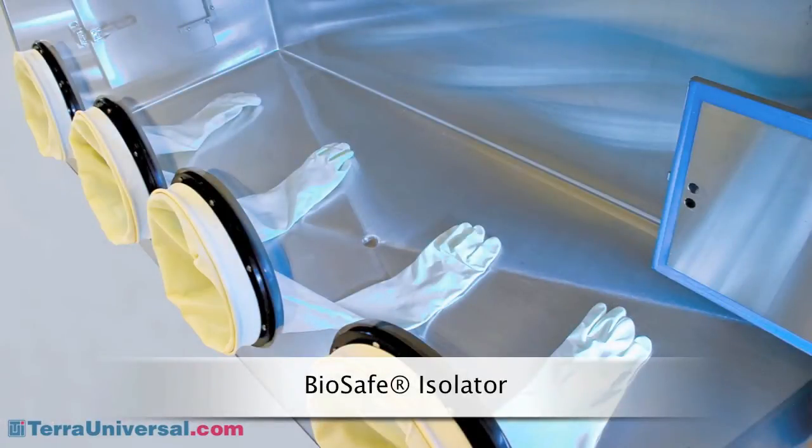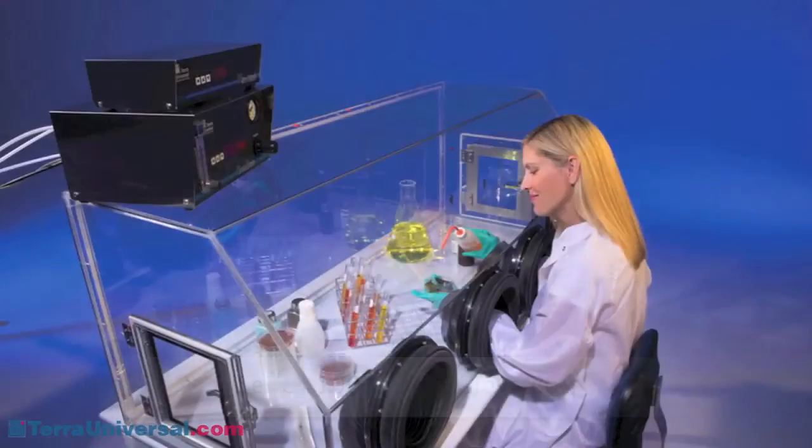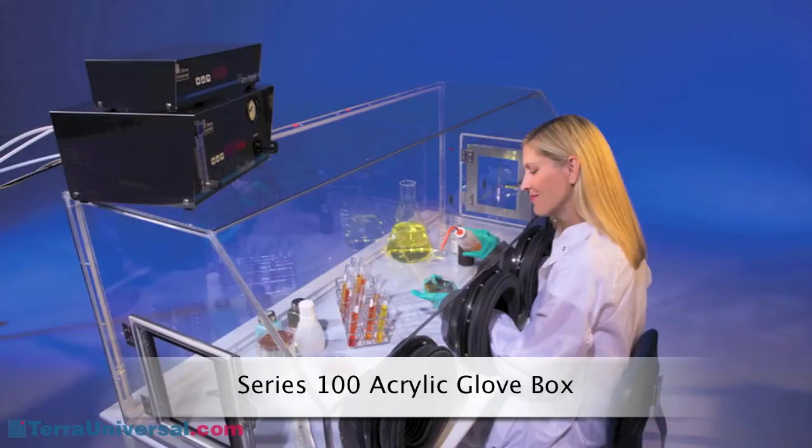BioSafe isolators are easy to wipe down and stand up to strong disinfecting agents. UVC sanitizing modules enhance sterile processing. Plastic chambers are more economical; however, plastic models are not suitable for relative humidity requirements below about 10% RH. Acrylic chambers provide strength and clarity, but they do not hold up to strong cleaning materials, and they accumulate static charges that can degrade sensitive components.